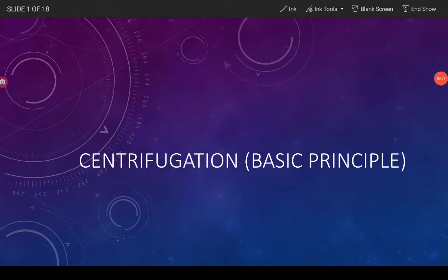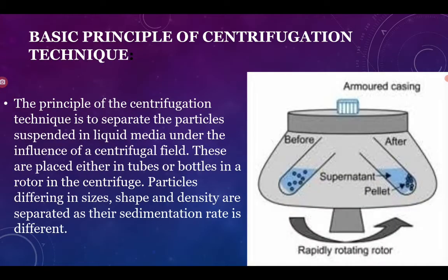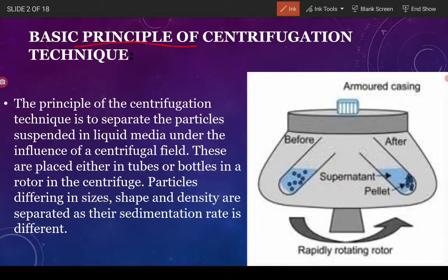Hello everyone, in this video we are going to talk about the general or basic principle of centrifugation and its types and types of rotors. So let's start. This is the first slide, and the basic principle of the centrifugation technique is to separate the particles suspended in the liquid media under the influence of a centrifugal field. Right, so what is a centrifugal field?